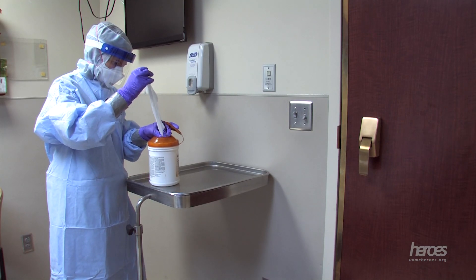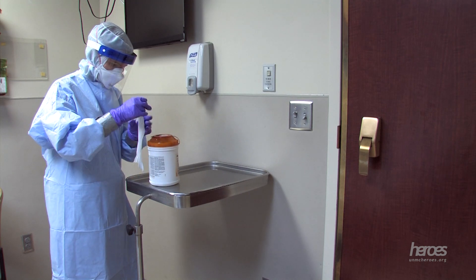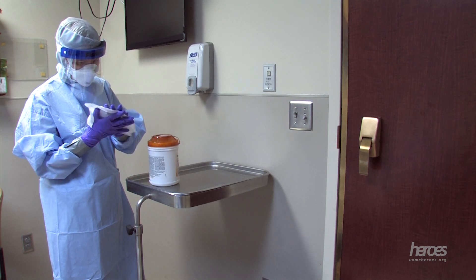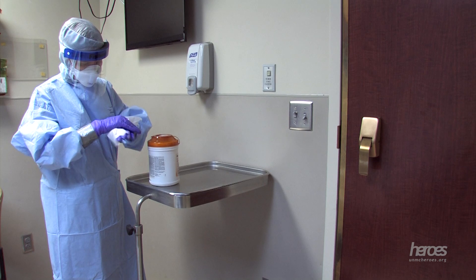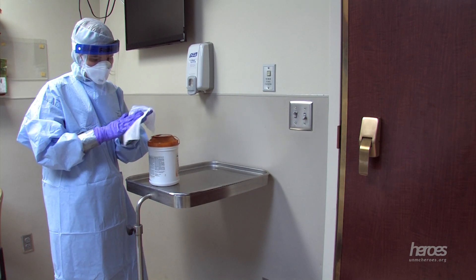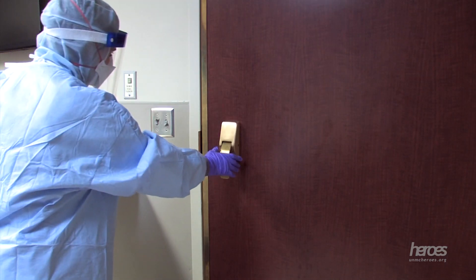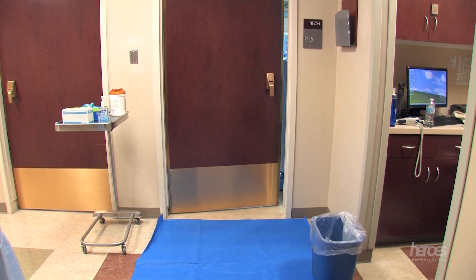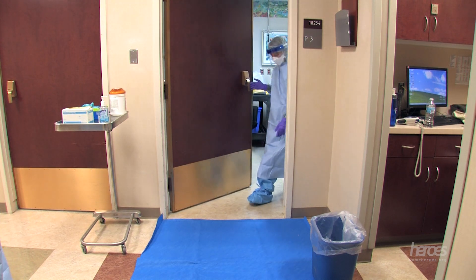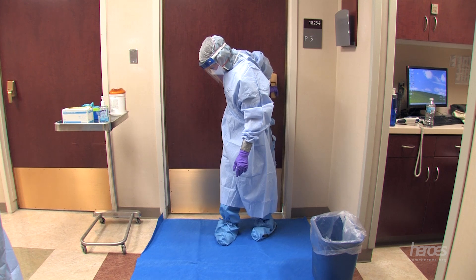The first step in the doffing process is to bleach wipe the long cuff purple nitrile gloves before opening the door to exit the patient room. Step out of the room onto the doffing pad, staying on the half of the pad closest to the patient door.